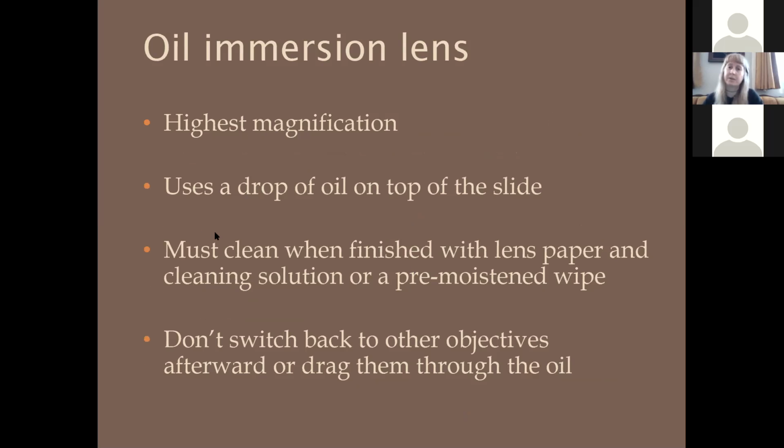Okay. So the oil immersion lens is going to be the highest magnification. So on mine, it's 1,000 times magnification. So the lens itself, the objective lens, is 100 times magnification, and then my eyeball lenses are 10 times magnification. So those multiplied make 1,000 times.